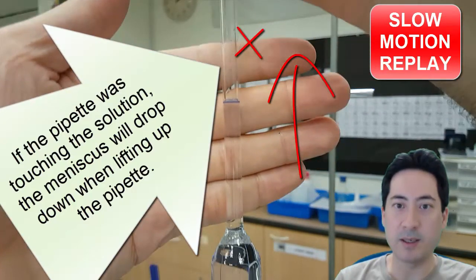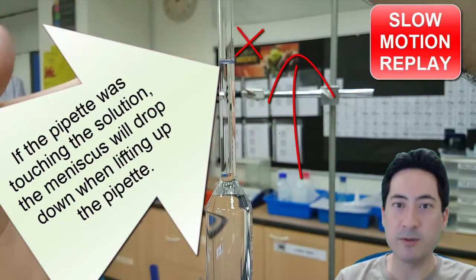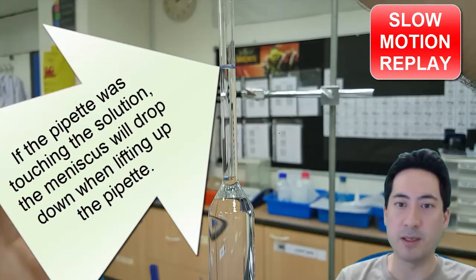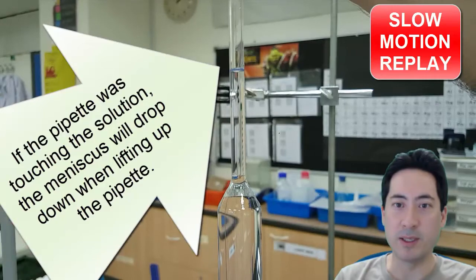And so as I lift the pipette up and down, I can see the meniscus isn't moving. But if the pipette was in the solution, I was moving it up and down, the meniscus would move up and down just because of that.